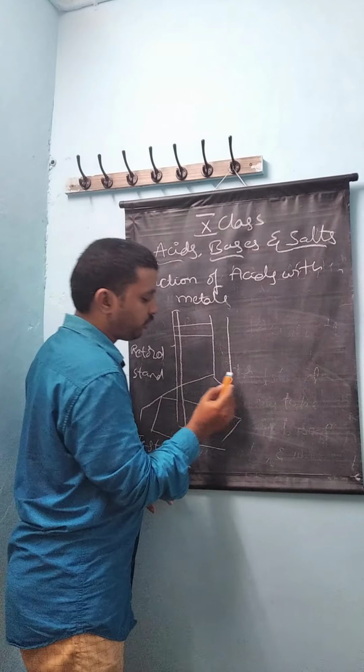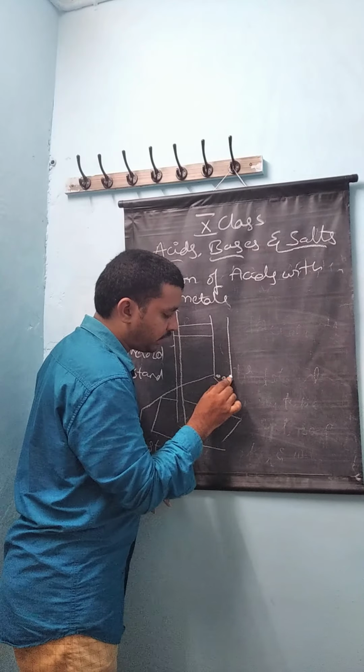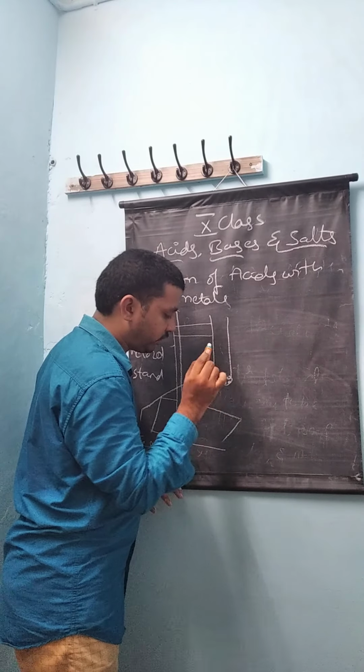Now we have to take some pieces of zinc granules.